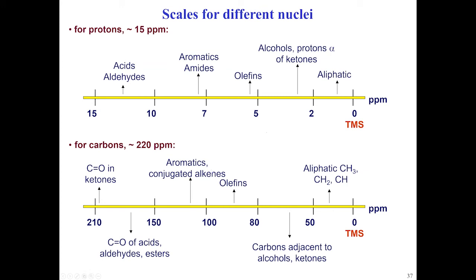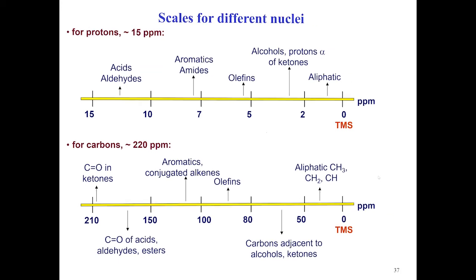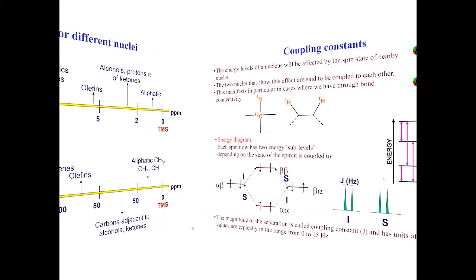Just a little hint, you see this is the C13 chemical shift scale. And you see aliphatic, aromatic, CO groups. It's very much the same, right? So it's sort of universal. Only also note, however, why would you look at carbon? You see the chemical shift scale is in excess of 200. Proton is about 10. So chemical shift offers you a much bigger frequency range, and that's of course the motivation for this.